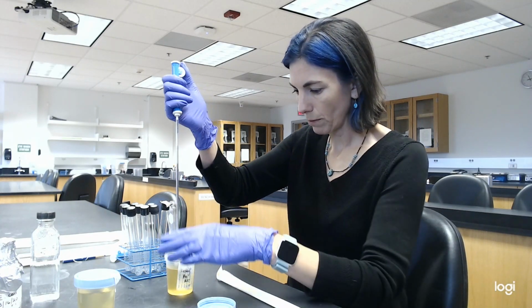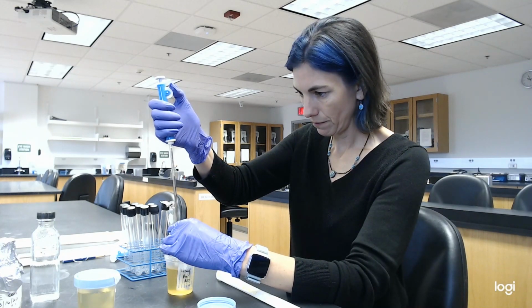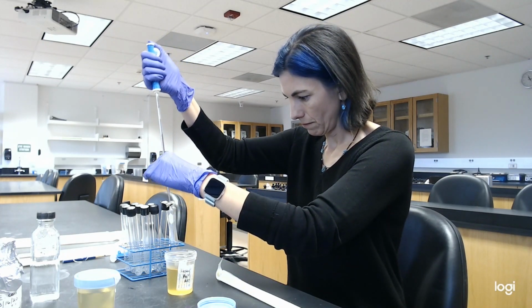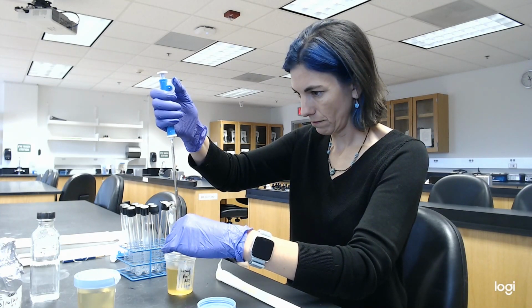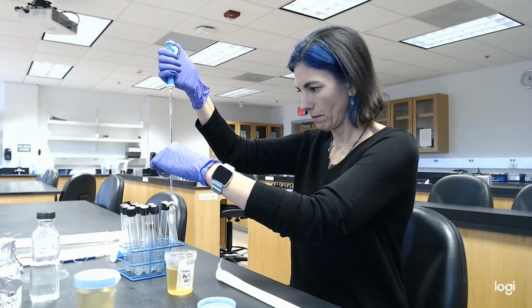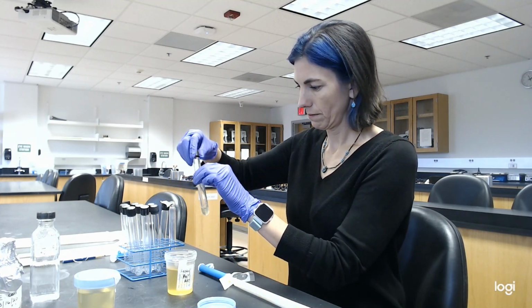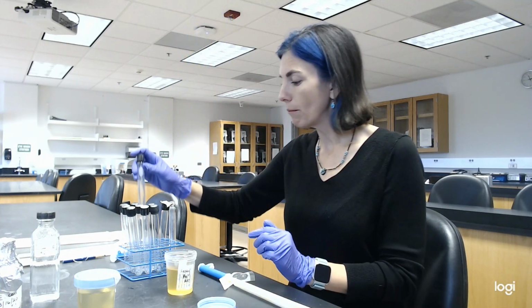Okay, so we'll do 2 mils of this as well. So again, the total amount in here is 2.5 mils.